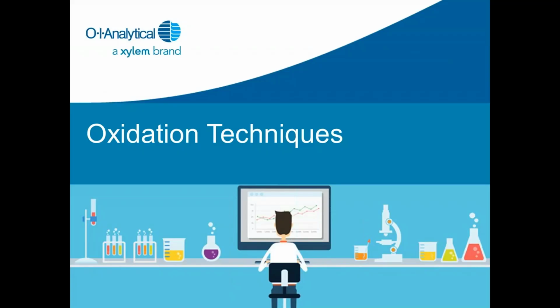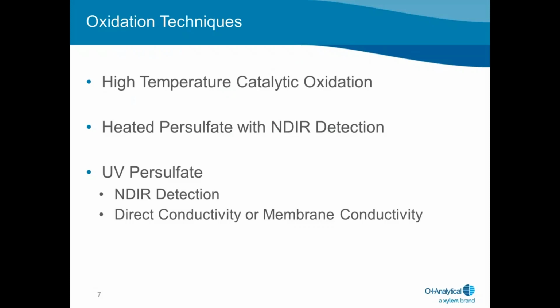I will cover the oxidation techniques just very quickly that give name to the TOC analyzers that are available today. Today we have three primary methods for the determination of TOC in the laboratory: high temperature catalytic oxidation, heated persulfate with NDIR detection, and UV persulfate with either NDIR detection or conductivity or membrane conductivity detection.